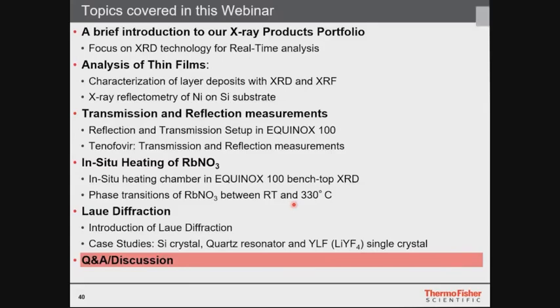So if it's sufficient to measure, let's say, 0.5 degrees 2 theta and upwards, then there is something we can offer. If it's necessary to measure below that, then we don't have a solution at the moment. We don't have SAXS instruments.